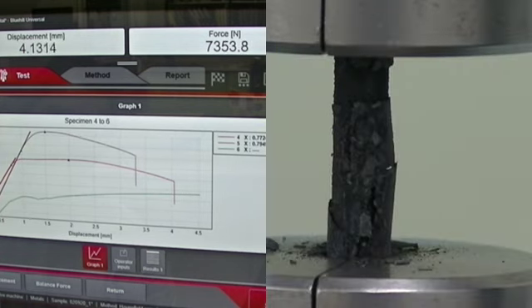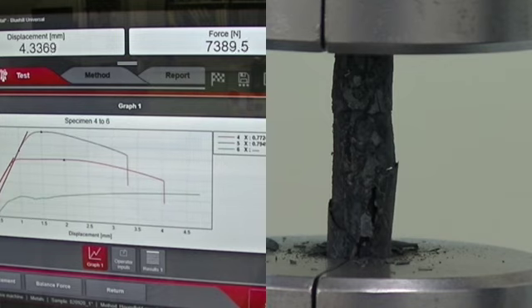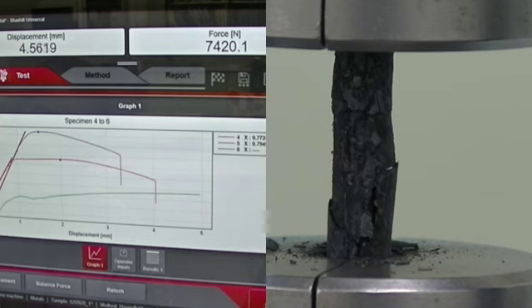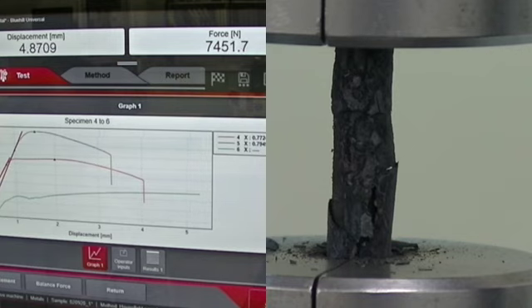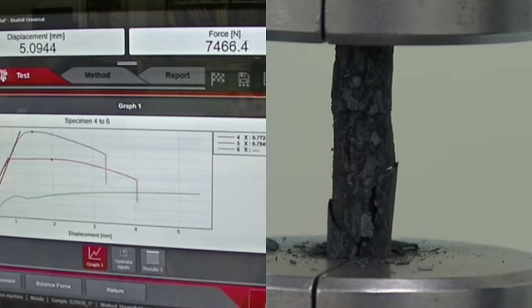The colouring is different on the annealed steel because it's been oxidized in the furnace. The furnace used is not a vacuum furnace, hence the air oxidizes around it and forms this carbon layer. During the test, some of the carbon layer will flake off, but this does not affect the results being investigated.